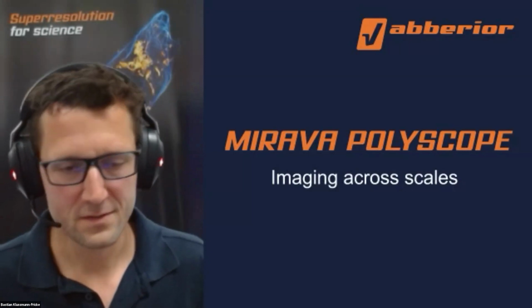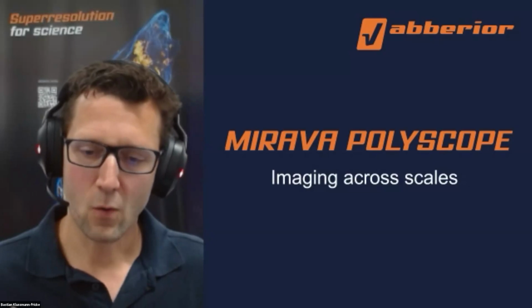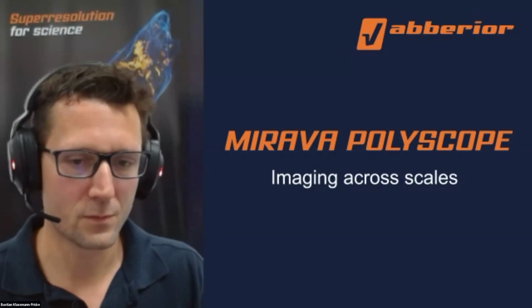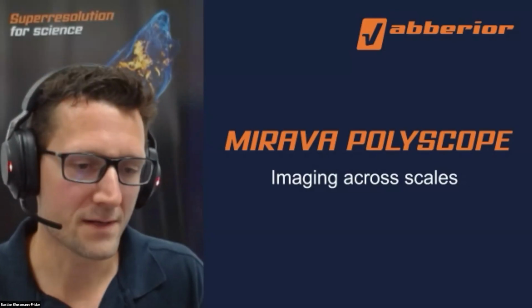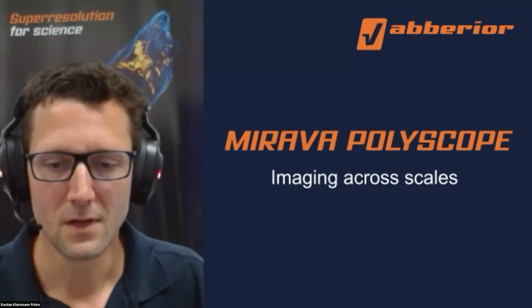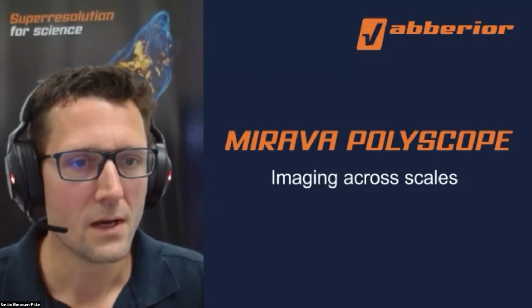As a MINFLUX measurement lasts a few minutes, I will just show you how easy it is to work with the system. So we are also able to make MINFLUX imaging, as soon as you have a good sample, easily accessible. So I'm now sharing my screen.